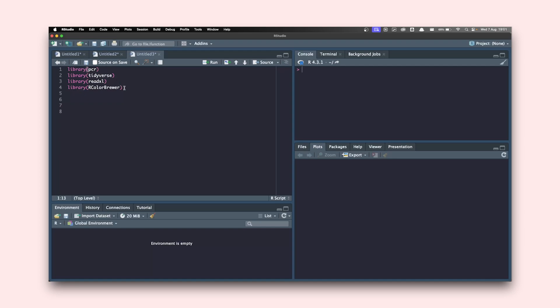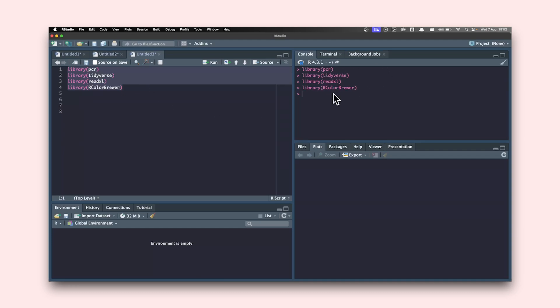I'm going to load all the packages I need. First is the PCR package, the second is tidyverse — I'll use certain functions from packages grouped inside tidyverse. For reading Excel files we use a package called readxl, because my raw CT value data is stored in an Excel file. Finally, RColorBrewer provides a set of color palettes for the graphs we make. I'll select all of these and hit Command+Enter to load them into the environment.